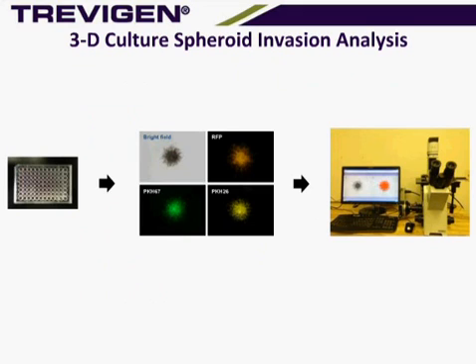we use image analysis, but there are some choices here in terms of how this analysis is conducted. You can use bright field microscopy or fluorescence. We've used red fluorescent protein expressing cells, as well as cells that have been labeled with lipophilic membrane dyes, such as PKH67 and PKH26.